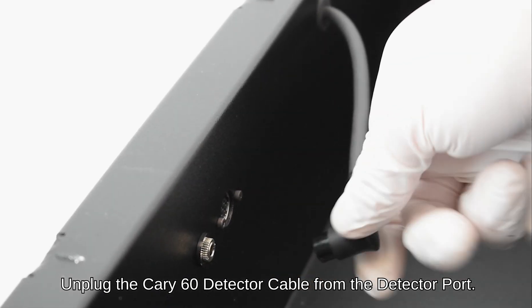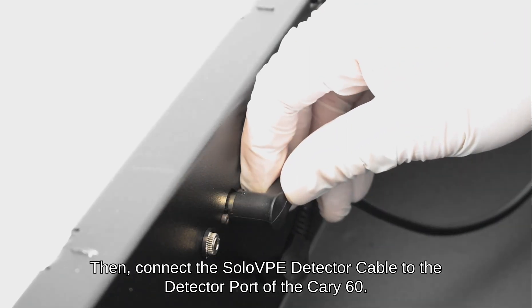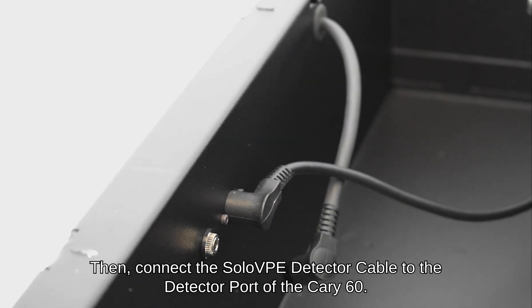Unplug the Carry 60 detector cable from the detector port. Then, connect the Solo VPE detector cable to the detector port of the Carry 60.